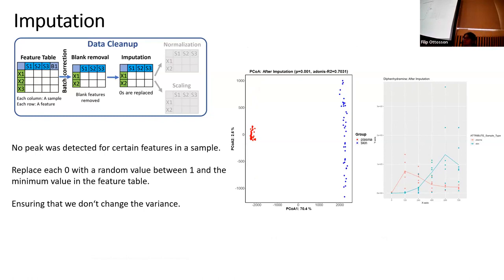And the second step is imputation, as it's been already discussed as well. The data is super sparse. There are so many zeros in it. For certain applications, mathematical operations like PCA and all, it doesn't deal well with the zeros. So what we do here is that we want to impute these values.